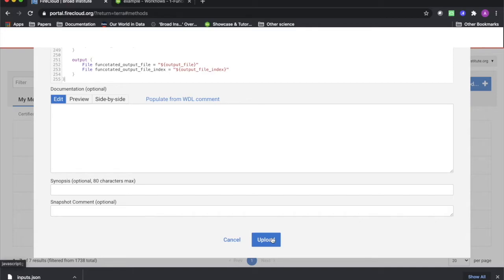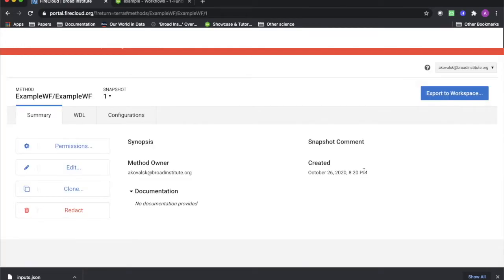Once you've uploaded the WDL to the repository, click on its name to see this view. From here, you can export this workflow to your Terra workspaces.